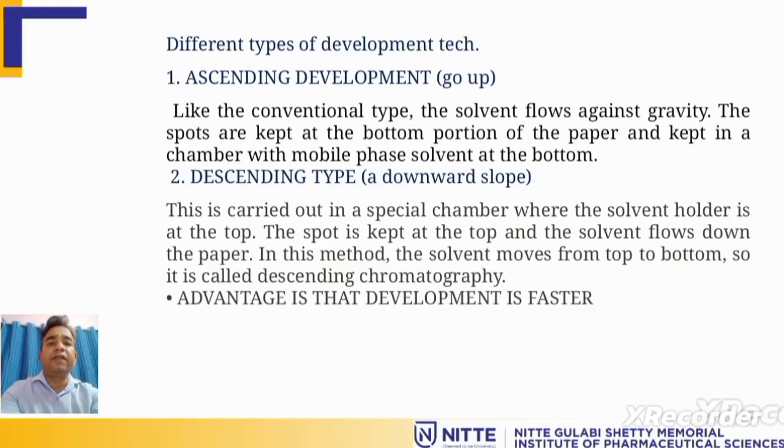So what are the different types of development techniques? We have already seen this when we were learning about the TLC. So I have not gone so detailed about the previous slides regarding the principle and the mobile phase and stationary phase used, because we have already seen them in the introduction part of paper chromatography where we have discussed it. So let us see what are the different types of development technique.